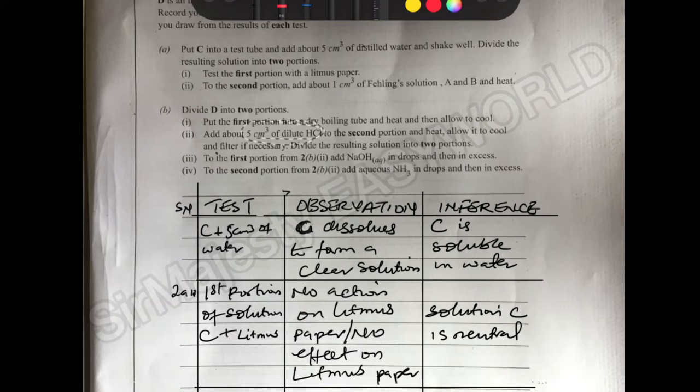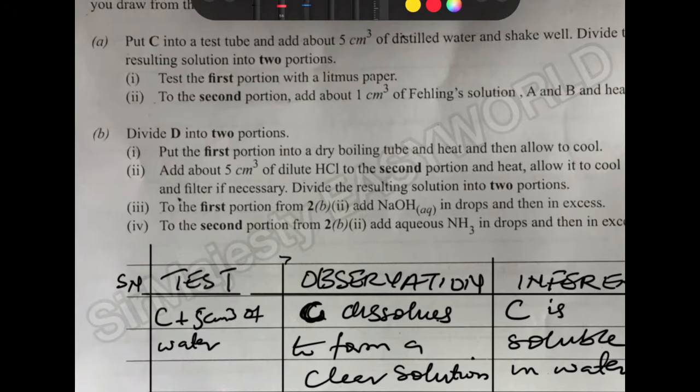The problem there is that the examiner just says dilute. They don't know the strength of the acid. If they say dilute acid, of course 0.1 is dilute acid. You can take 0.1, 0.2, 0.5 as dilute acid.